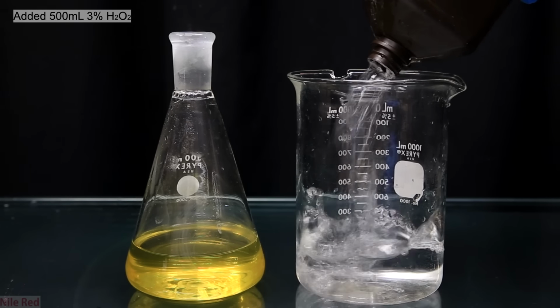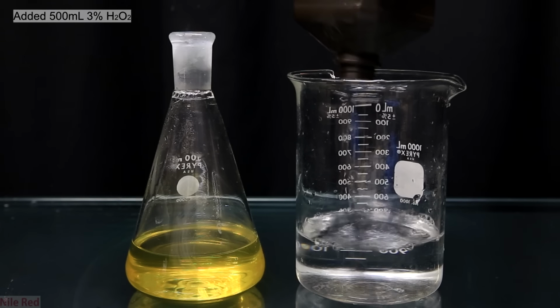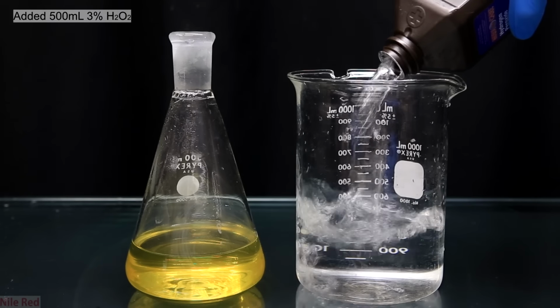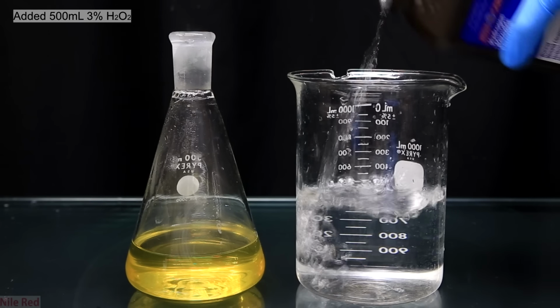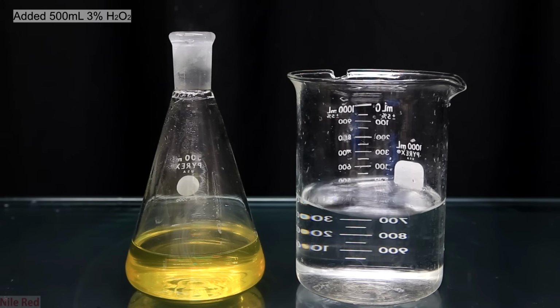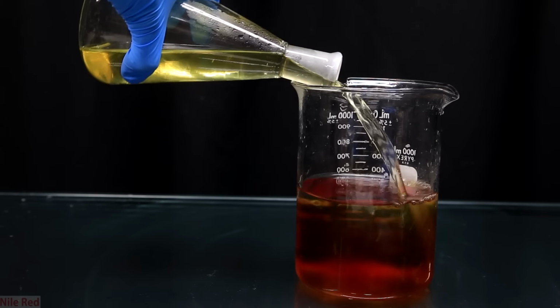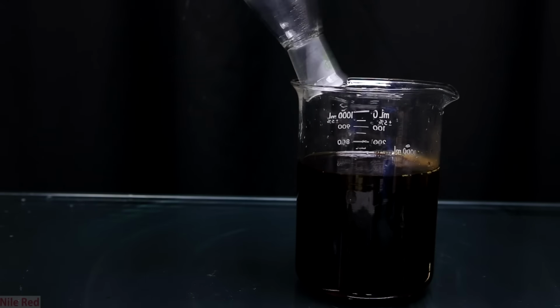To a 1 liter beaker, I added 500 milliliters of 3% hydrogen peroxide. The goal in this step is to use the peroxide to oxidize our sodium iodide to the elemental iodine. To do this, it's very simple, and we just pour in the hydriodic acid solution to the beaker.